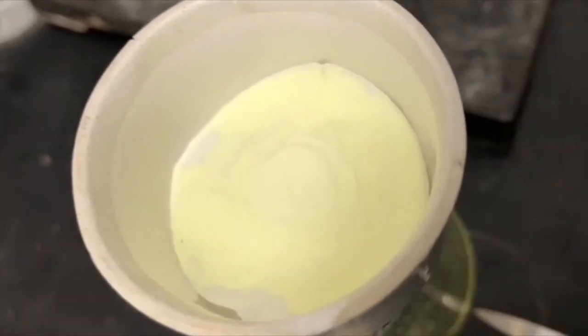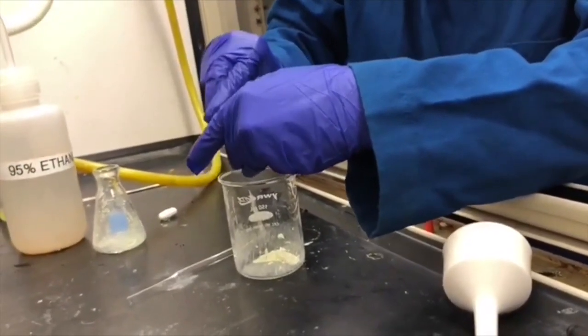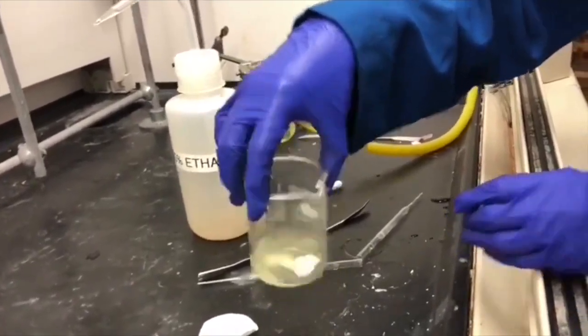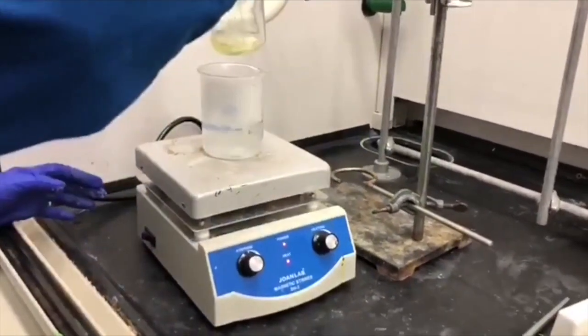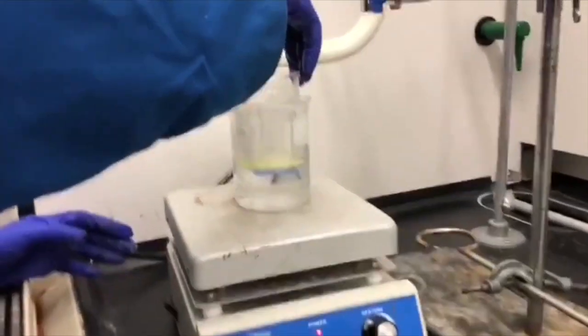And this is what it looks like after it's been dried. Here I'm scraping our product into another beaker, and I dissolved it in some 95% ethanol using a hot water bath to dissolve everything.